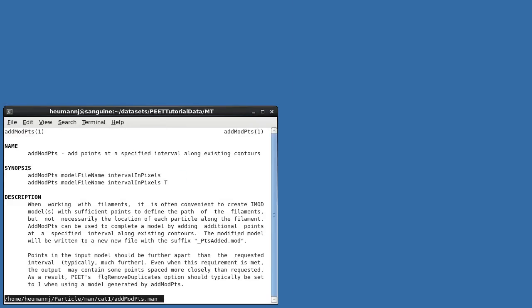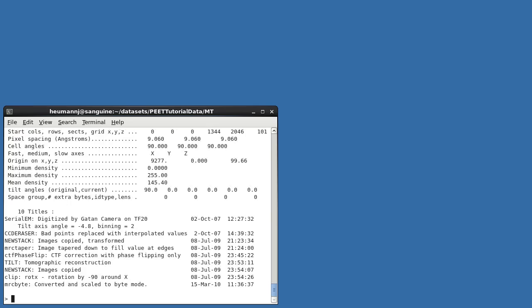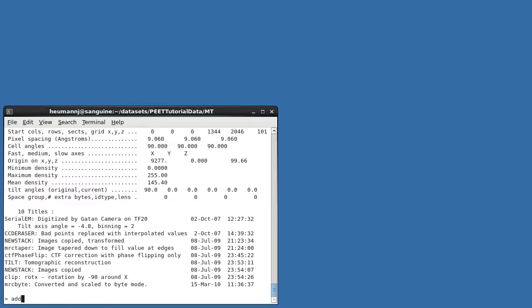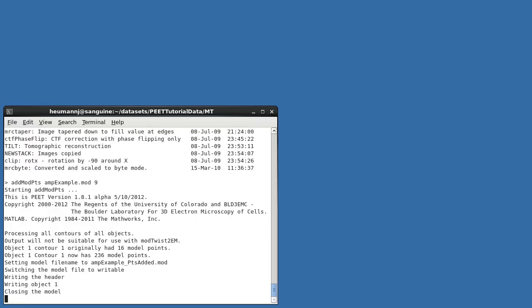Looking at the man page for addModPts, you can see that we'll need to specify the desired interval between points as an integer number of voxels. Using the imod command header, we can see that the voxel spacing for this volume is 9.06 angstroms per voxel. Since we'd like points approximately every 8 nanometers, I'll run addModPts specifying an interval of 9 voxels between points.